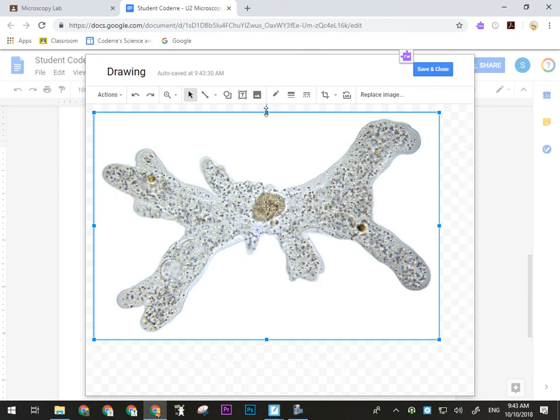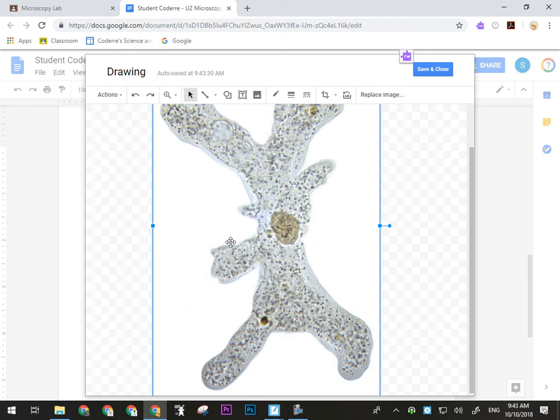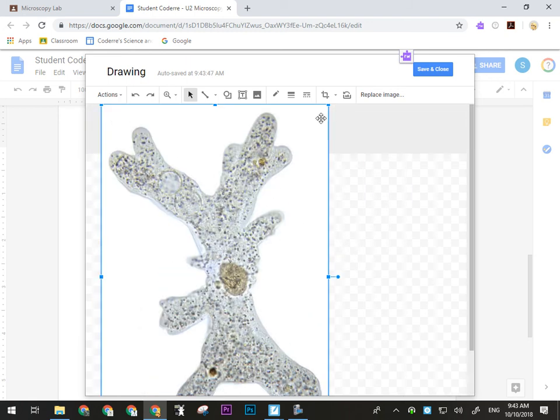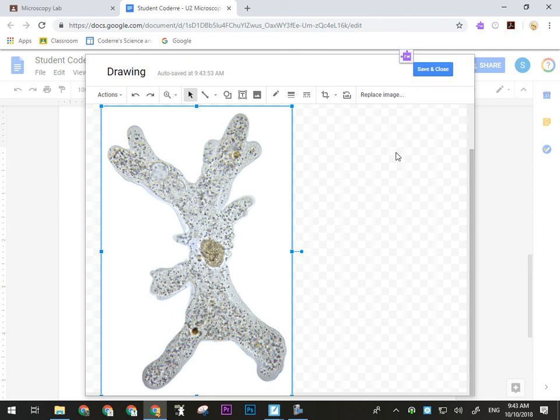Now, this orientation is probably not all that practical for what I want because I want to be able to put labels off to one side. So I can rotate it clockwise, and then I'm just going to move it over. Now I've got that drawing there. I'll probably shrink it down so it actually fits in the checkered area. Now I need to use lines.